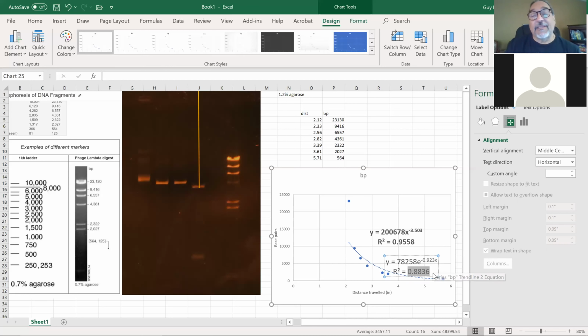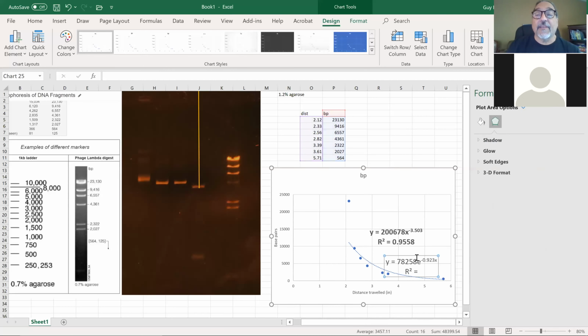But it's really entirely how you want to do it. I'm going to go ahead and get rid of that second box here in a minute. There we go. But it's really up to you to decide how you want to attack this problem. In the laboratory, when we're doing this at the graduate or research level, you always use the best R squared value, because that's going to give you the best estimate for your unknowns.